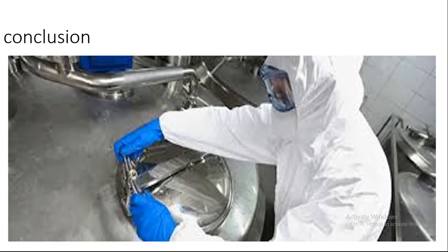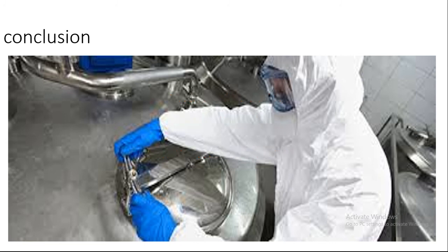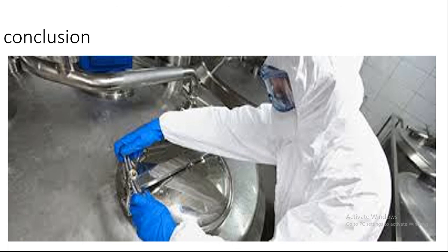I'll speak about the conclusion. It is practically impossible to prove that production equipment is clean at the level of 100%. However, it is possible to prove that the traces of active product remaining spread through the equipment part are within an acceptable limit, and that we are capable of detecting and quantifying these trace levels. Cleaning validation provides a means of proving that the contamination levels have been reduced below contamination acceptance limits.